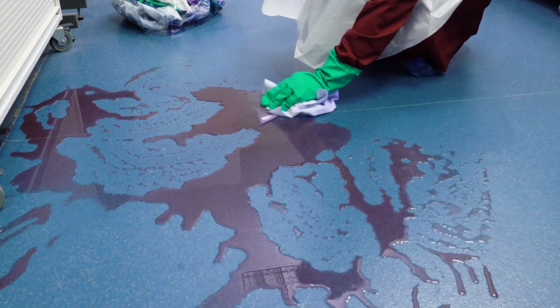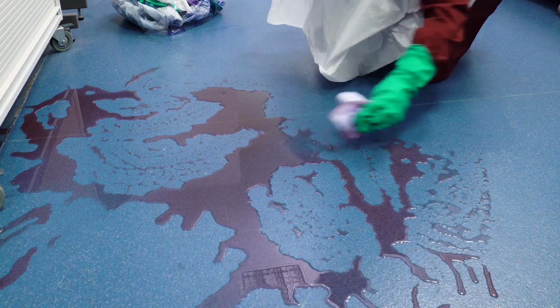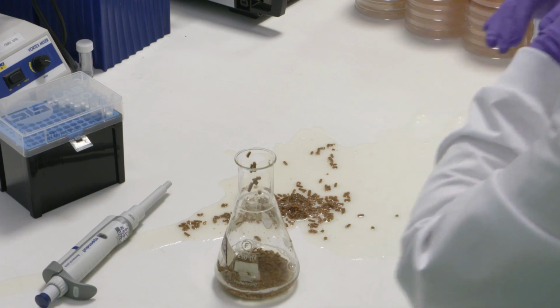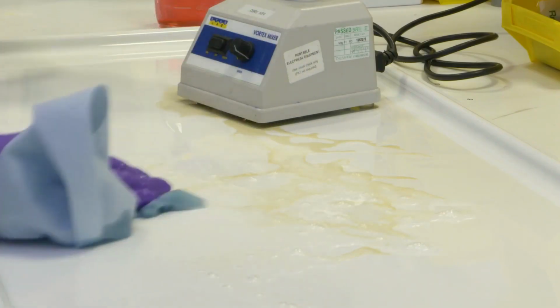In the laboratory, there are many surfaces and pieces of equipment that can become contaminated by biological agents or other hazardous materials. Decontamination is required to reduce the risk of infection or harm.